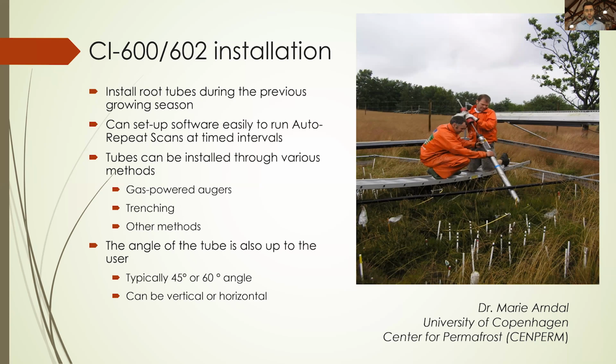But what you can also do, if you want to do a single location and just scan over a long amount of time, is tell the software to do repeated scans, either every 5 minutes, 15 minutes, up to 12 hours. Once you put that in, the scanner will just sit there, and every, say, 5 minutes, it will make a scan of the roots, and again for 12 hours. You can do this as long as it's plugged into a computer and the computer has power.